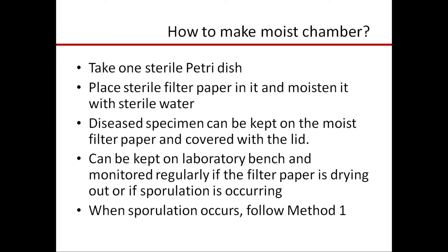Keep the moist chamber on the laboratory bench and monitor the filter paper to check whether it is getting dried or whether sporulation is occurring on the leaf surface. When sporulation occurs, follow Method 1: use a sterile inoculation needle to touch the spores and streak on the medium in a Petri dish or slant. Alternatively, stab the needle into growth medium so that some medium gets attached, then use that media-covered needle to touch the spores, dislodge them from the spore-bearing structures, and streak onto the Petri dish or slant.